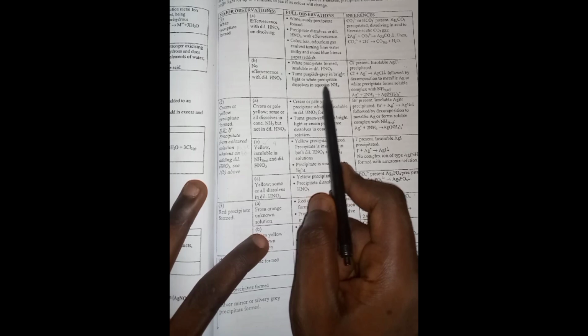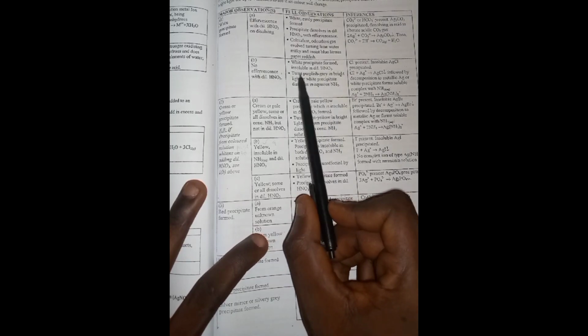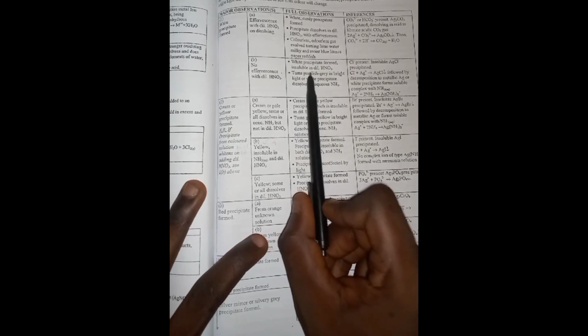Copy: white precipitate formed insoluble in dilute nitric acid, then turns purplish gray in bright light, or white precipitate dissolves in aqueous ammonia. You are going to copy all what you have here, though you did not give time for the precipitate to turn gray brown in bright light. Okay, you didn't give time, so you are going to come here and copy all what you have here. Then under the inferences, chloride ions present, right?